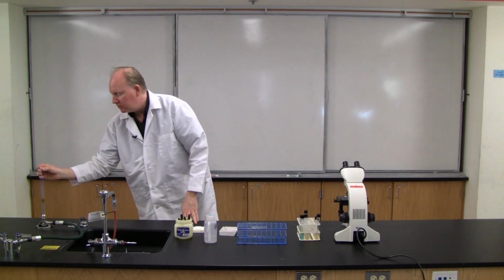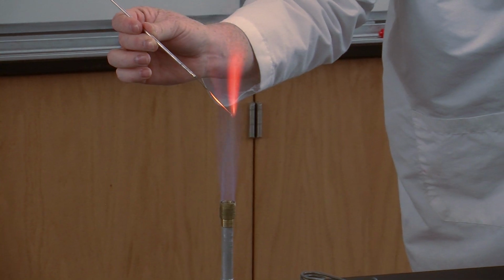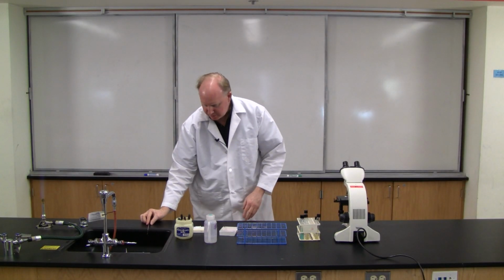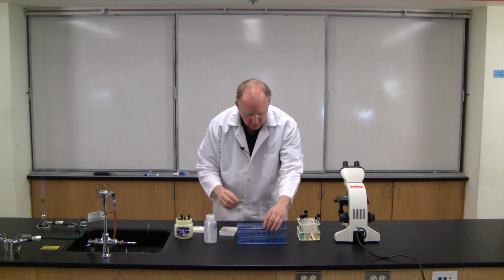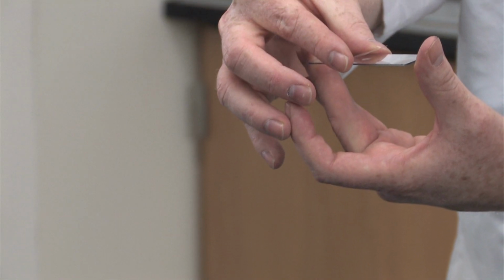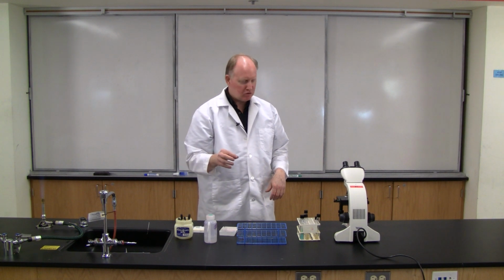Flame the loop, again from the base towards the tip. And all we have left to do is put a cover slip on top of the slide and then take a look at it under the microscope. So putting it down at an angle and just letting it gently fall down. You might get a few bubbles, that's okay. Bubbles actually help you find the plane of focus you're looking for.